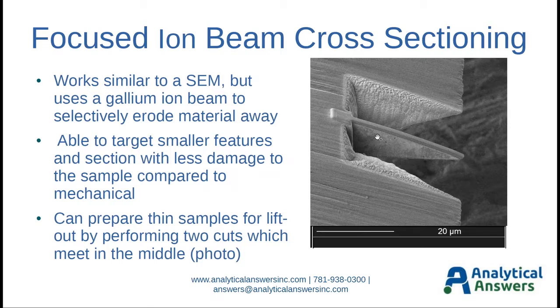So here's the blade edge, just the last 20 to 30 microns of the blade edge, you can see right there. And of course on a major scale, blades look very, very sharp, but when you zoom in on them, you can see the thickness, it really makes a mountain out of a molehill. So here we've done two FIB cuts that meet in the middle and leaves this freestanding little piece of the stainless steel blade that includes the very, very tip of the material. We also deposited a little platinum strip on the surface here to protect the coatings while we do the milling.